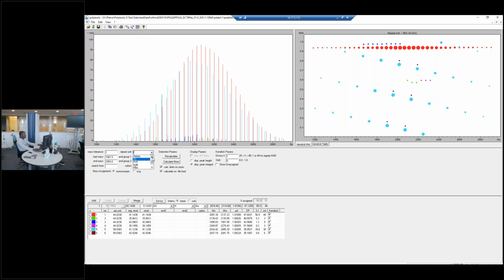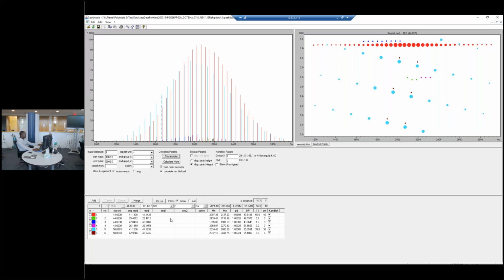All of these are things that you can analyze, PMMA too, easily with MALDI and be able to determine them or figure out if they correspond to what you're looking for in Polytools. You could also go in and match it with different kinds of ions, so sodium, potassium, different end groups, and calculate to figure out what's going on.